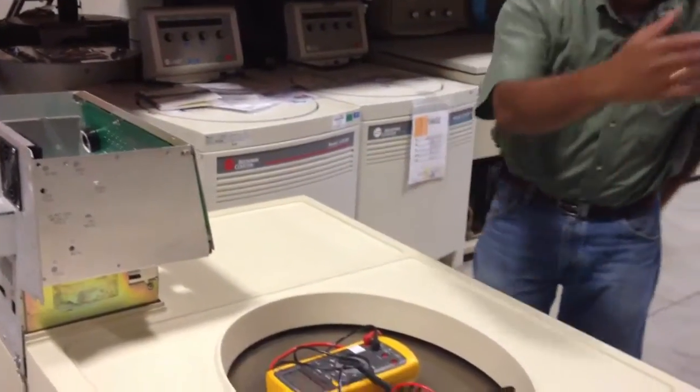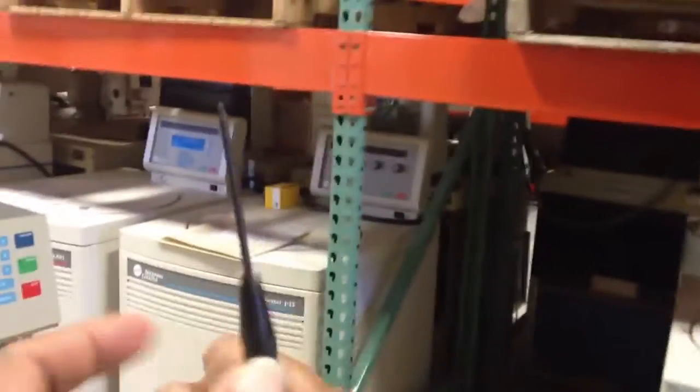Now you have to come to the front here. You need something like this — even an Allen key will work. This tool is very useful.